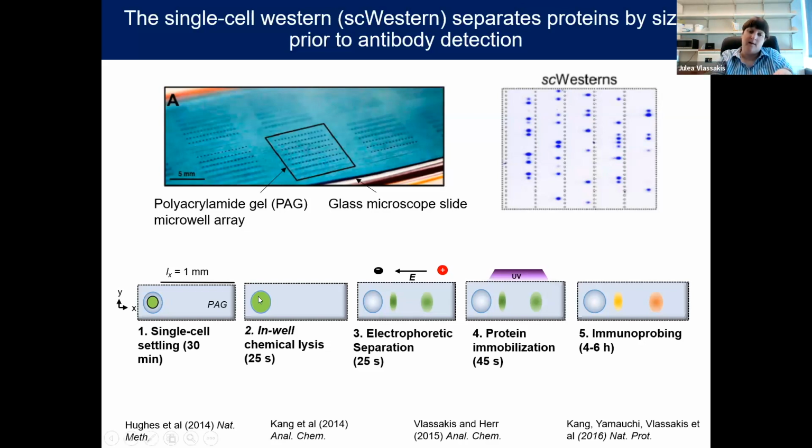in this microwell. Essentially, the complexes are too large to enter the gel in their complex state, but monomeric proteins in that kind of native lysis buffer and electrophoresis buffer are able to migrate into this gel. And so through a multi-step assay, we're able to physically separate, ultimately dissociate the complexes, migrate them in a distinct region of the gel, and then measure the relative levels of the complex and monomer protein. I'm happy to answer questions about that.